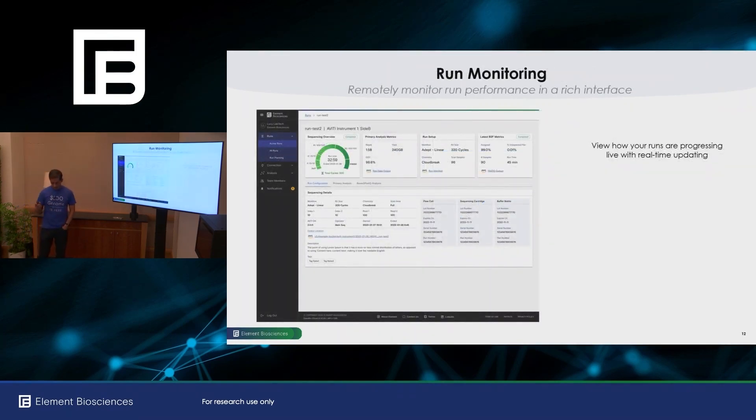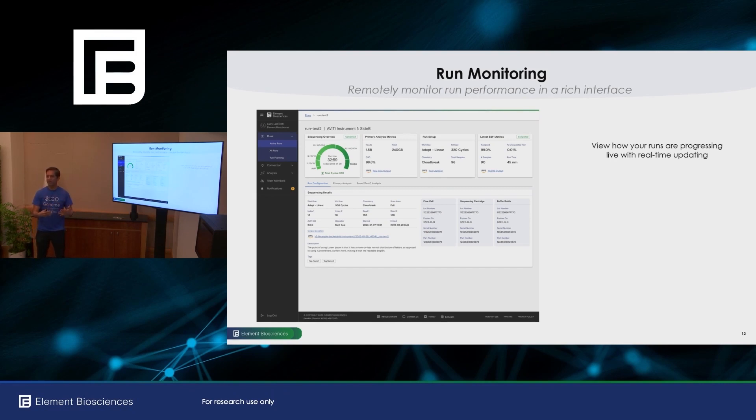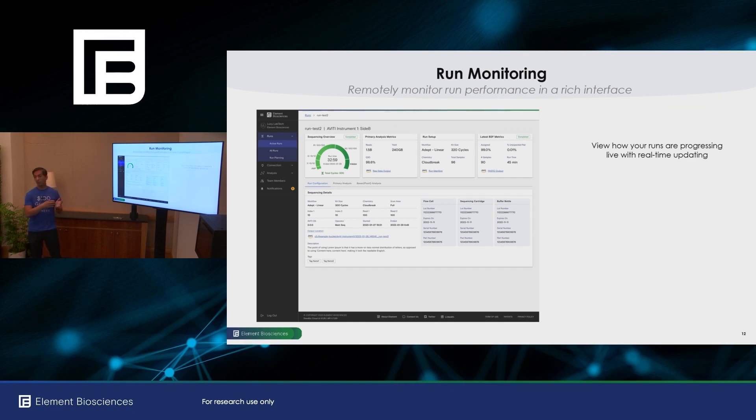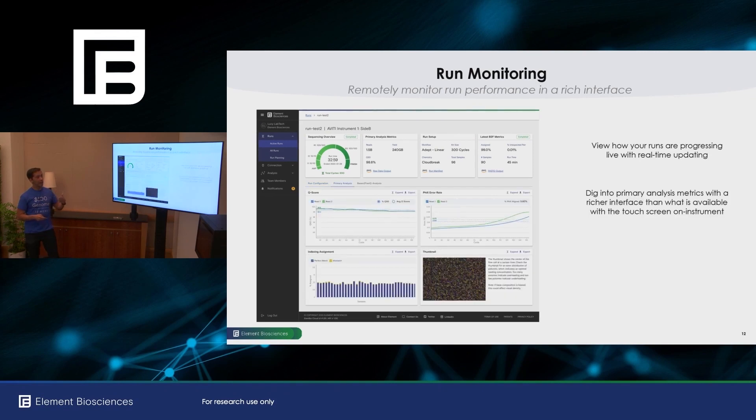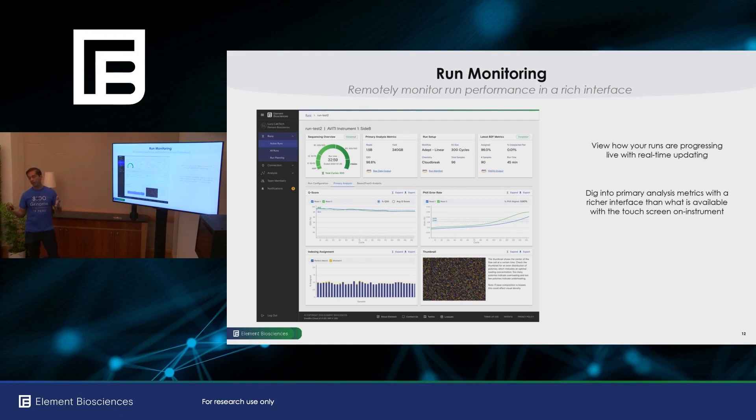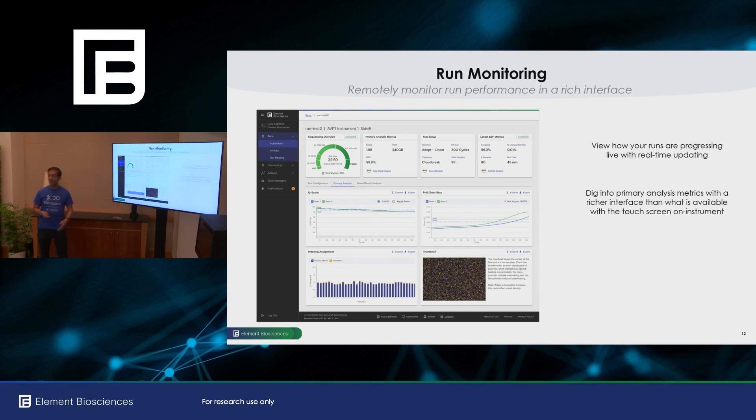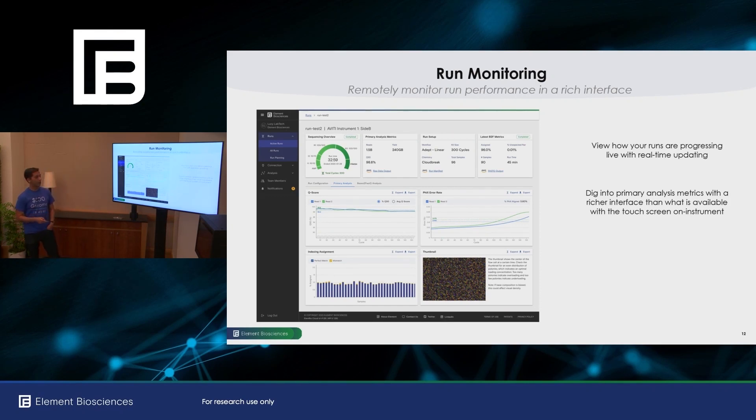So as I mentioned, with Aviti OS 2, we're going to have a bunch of primary analysis metrics, which is great, but then you have to be right in front of the instrument to see them. So with Element BioCloud, you don't have to do that. You can view these data remotely. You can look at all of your runs across your entire fleet of instruments. And for active runs, you'll get real-time live updating as the data is being processed on the instrument. And because this is now a desktop web interface, you can benefit from the richer interface available. You can dig deeper into the types of analysis metrics. In particular, for example, the indexing assignment that I talked about on instrument, you just get aggregate statistics where here you can dig into the individual metrics for each sample and see which ones are under or overrepresented.